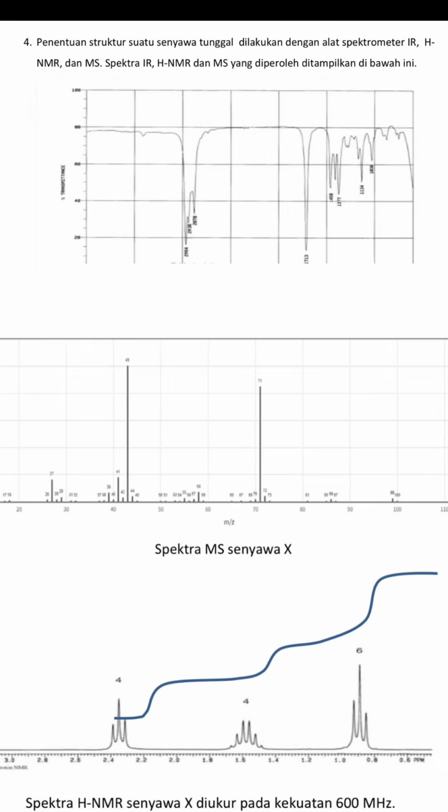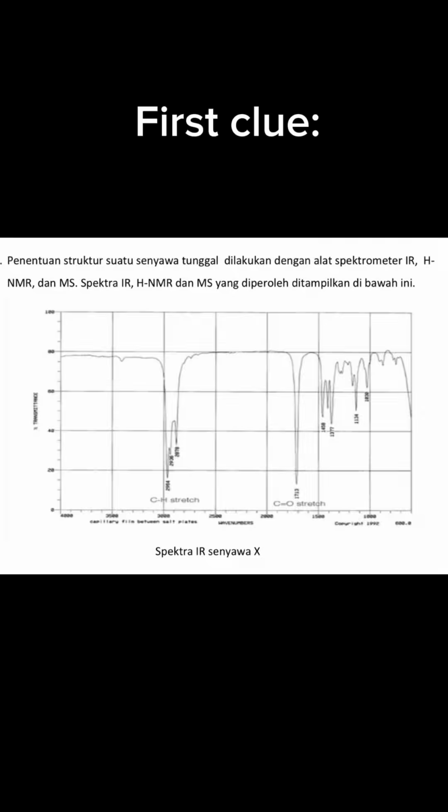One day, one problem. Day 2. Today we're going to identify an unknown organic compound. And to do that, we'll use 3 different spectroscopic techniques, like detectives collecting clues. Our first clue is IR spectroscopy. But what even is that?